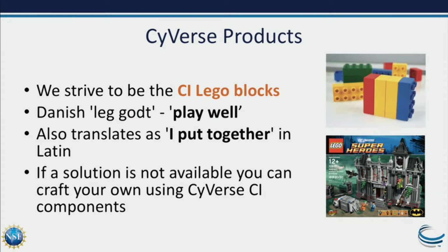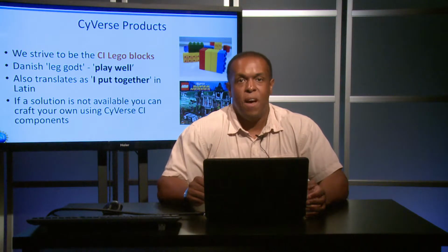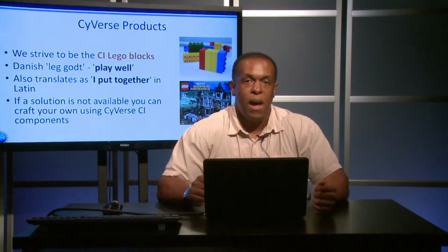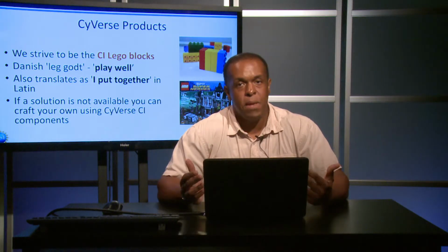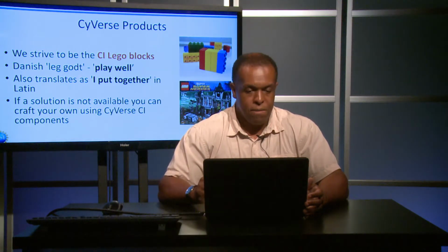So let me now take a moment to move and transition into the actual products. These are the things that come with your CyVerse account. As we saw from the opening poll, and this tends to be the case, most of our users find out about us via word of mouth. And so we'd like to make sure that everybody, whether they're a little bit familiar with CyVerse already or whether this is their first time really having any kind of training, understand what it is that CyVerse delivers.